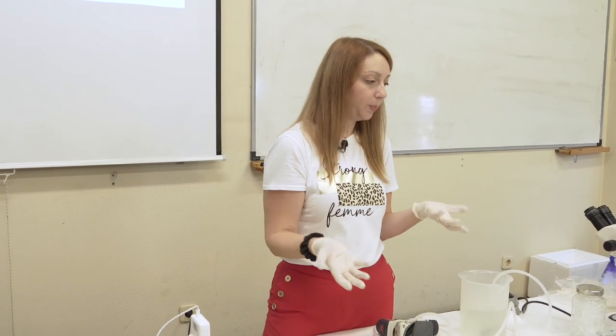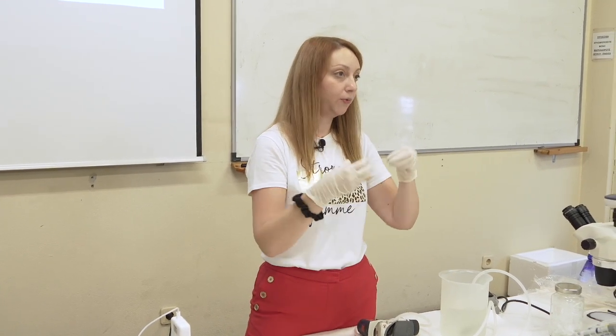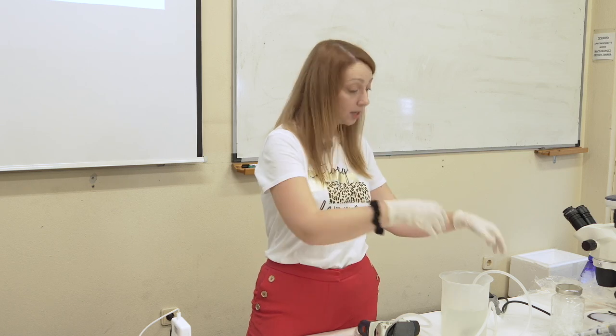We prepare a bottle of distilled water in the lab, and then we filter it in the field, again with a clean hose. Are you filtering water straight from the pond, for example, or doing some pre-filtering? Most of the time we do it directly from the field.